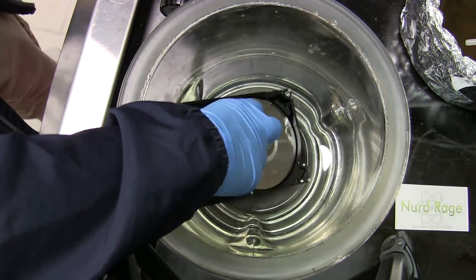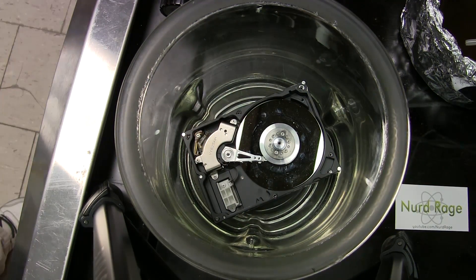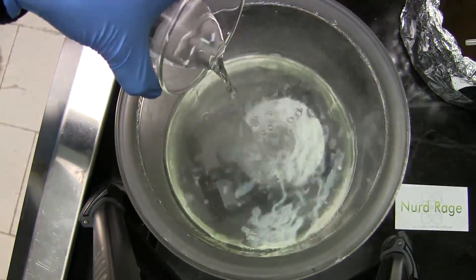So here's the hard drive. I've taken the cover off so the acid has better access. First some water, so the salts produced from the acid reaction will dissolve better. And now the acid itself — hydrochloric acid, also known as muriatic acid.